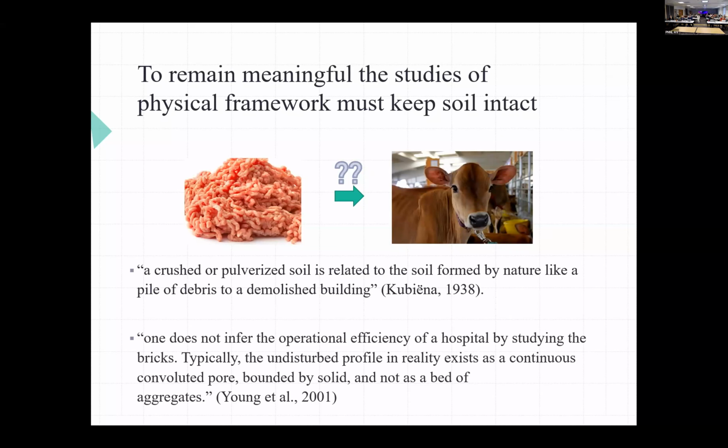One opportunity that X-ray CT offers is to study that system of vessels in its intact shape. What soil scientists typically do is take a soil sample, sieve it, grind it, and do some measurements.